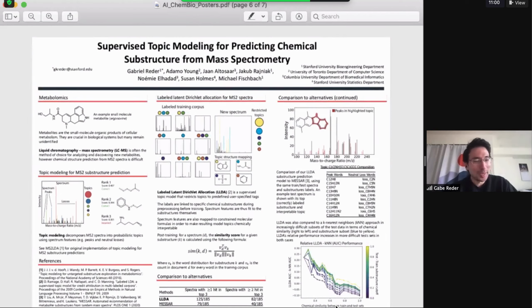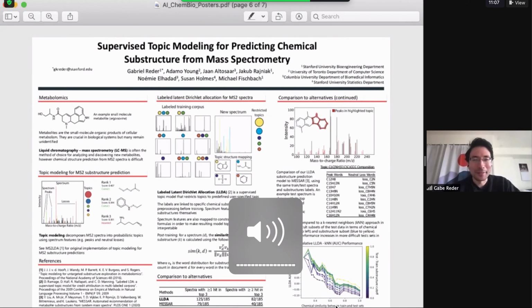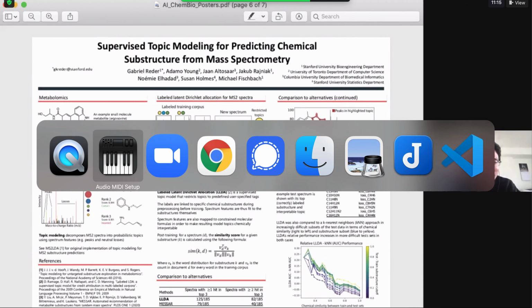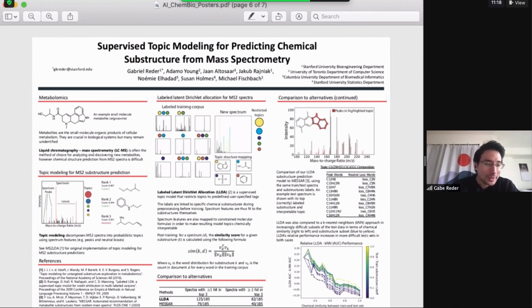The text to image ratio here is not ideal, but let me walk through this. So this work concerns itself mostly with MS2, tandem mass spec, especially coming from liquid chromatography mass spectrometry. And this is a nicely constrained problem because we have ideally one molecule, whose structure is often unknown, at low concentration, and we want to figure out what is the structure we're dealing with here.